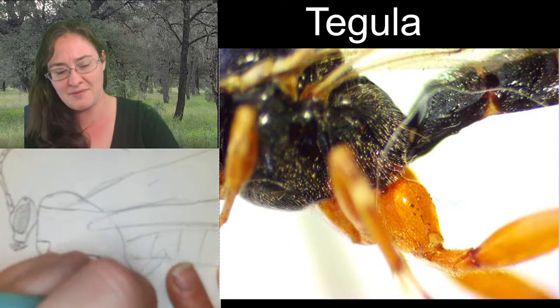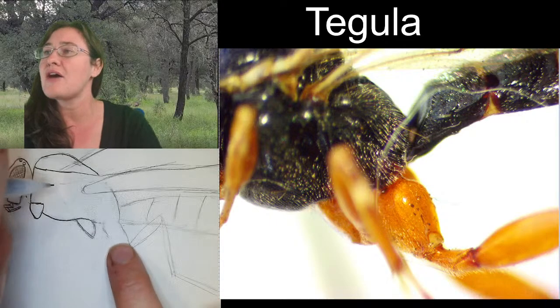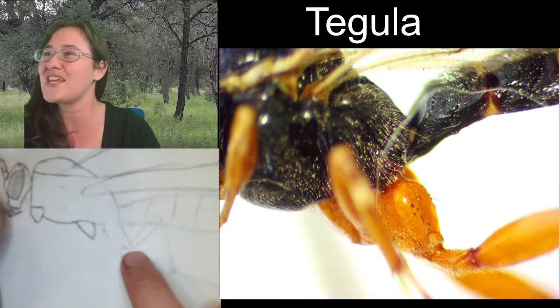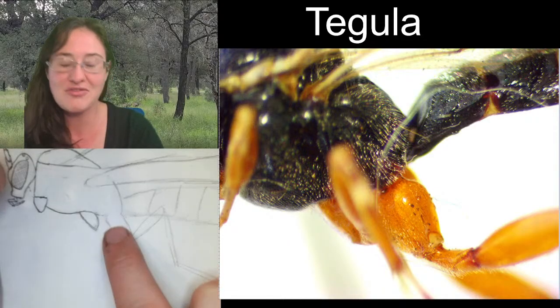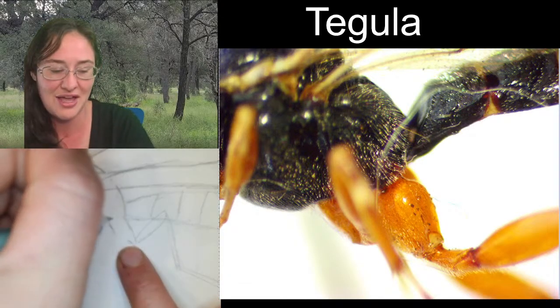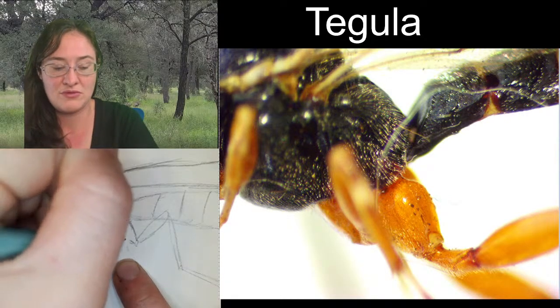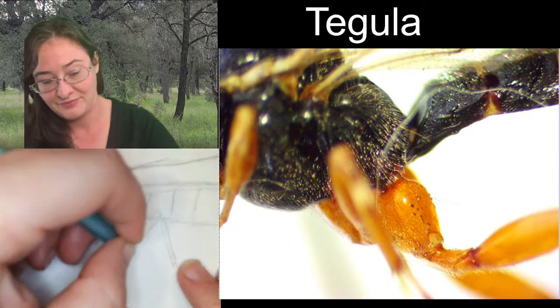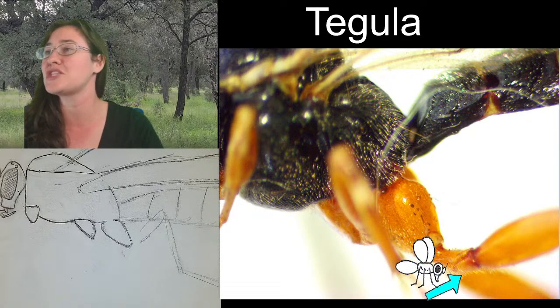I'm going to erase my sketch of my femur and my tibia, because I think I'm going to be changing the angles of those anyway. Now, our metacoxa back here is wide at the top. It's kind of, like you said, it looks bulbous. It almost looks like it's been working out. So it's connected right here to the third segment of our thorax. Let's see, looks like that. And the trochanter is really, really easily visible. It's right there.